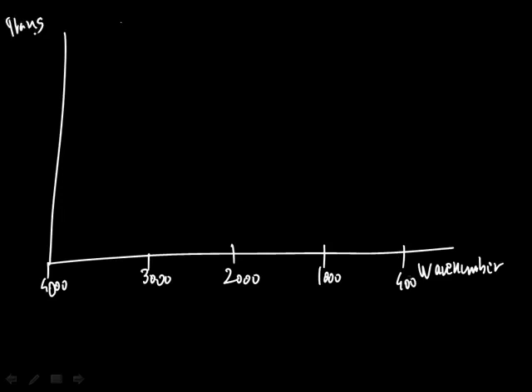Now, our IR spectrum does not include only these things. So if we just draw a schematic of an IR spectrum, then on our x-axis will be wave number. And this will start at about 4000, go to 3000, 2000, 1000, and it will end up somewhere around 400. Our y-axis will be transmittance, which is expressed in percent. It's basically the percentage of light that went through. And so most of our IR spectrum will not have any absorption. So we'll pass the light and no light will be absorbed, and transmittance will be 100%.